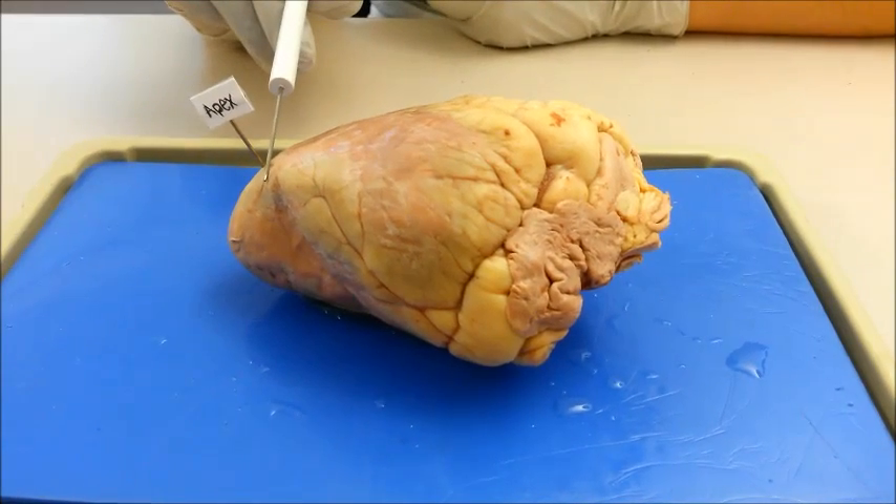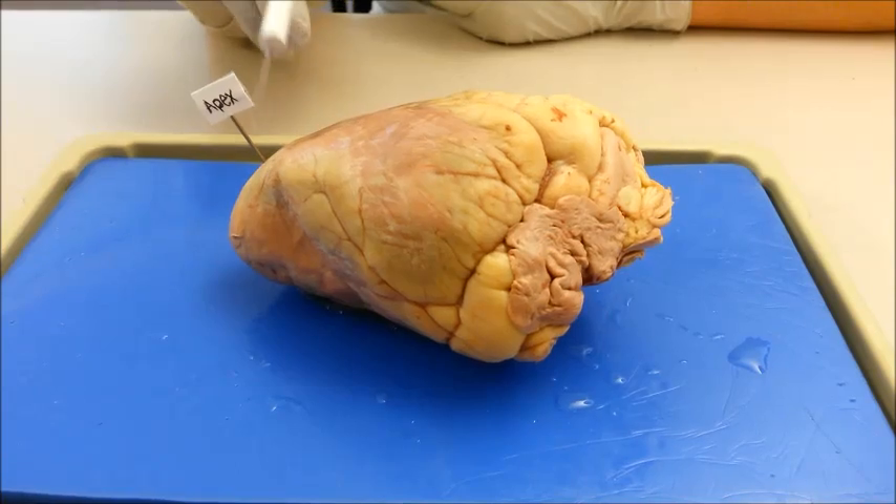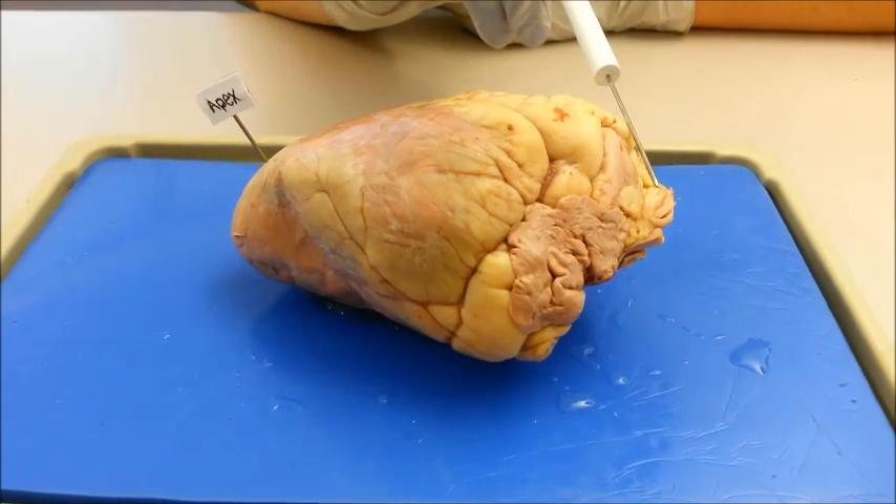The apex is the pointed end of the heart consisting of muscles from the left ventricle. Located on the opposite end of the heart is the base.